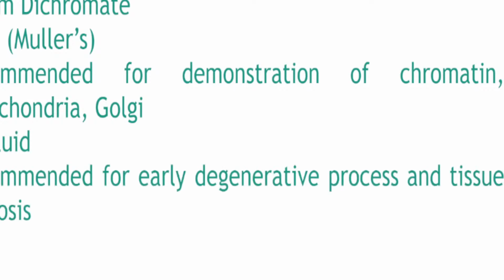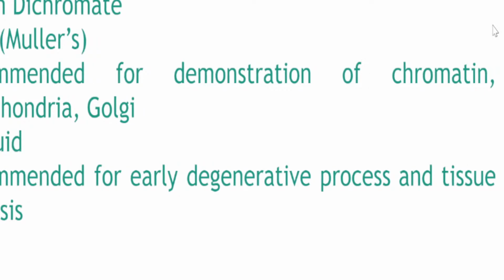Okay. Orth's fluid is recommended for demonstrating early degenerative process and tissue necrosis. So if you hear terms like ischemia or rhabdomyolysis, you'll probably see the word Orth's fluid as part of the histopathology portion of it. If you want to delve deep into that kind of discussion, please go to the link Moyo has provided for you guys after the show.